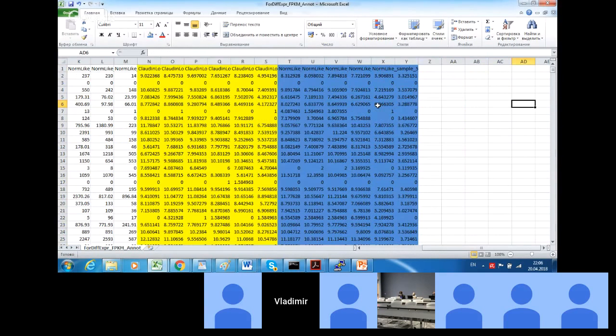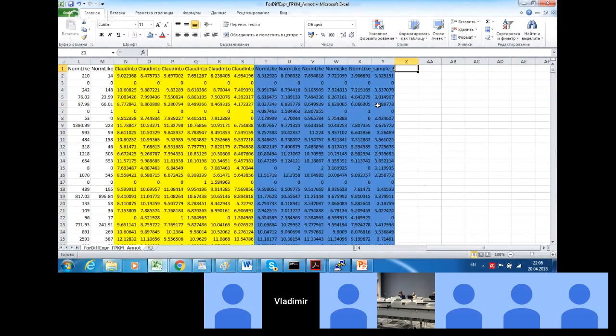And then what are the main characteristics we'll use? As we discussed, it might be interesting to look at mean expression levels to be cautious with genes with low expression level.